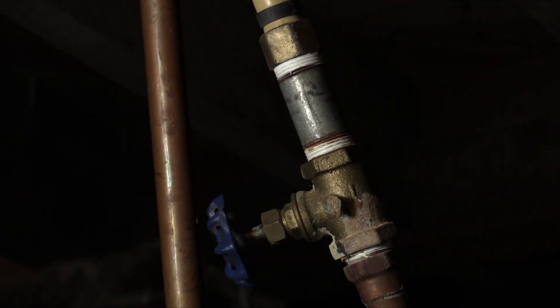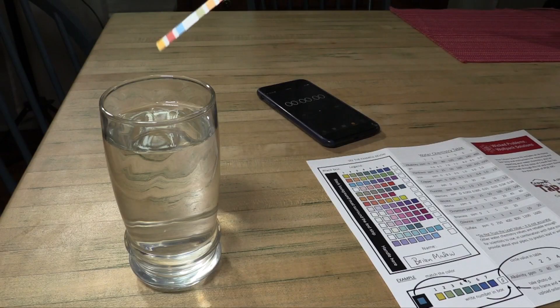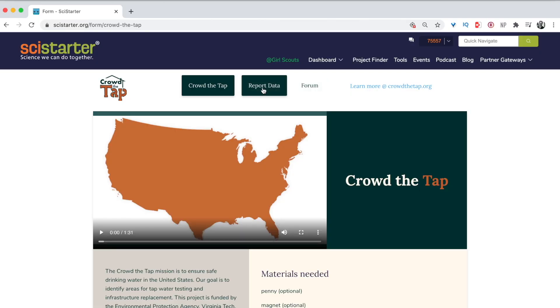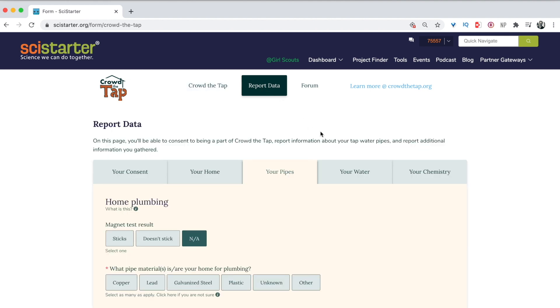If you've gotten this far in the Crowd the Tap process, you've already checked your pipes with the penny and magnet, done your water chemistry strip test, and entered your data at CrowdTheTap.org. Thanks for your participation so far! The Lemon Test will help us get more reliable results from this off-the-shelf lead test.